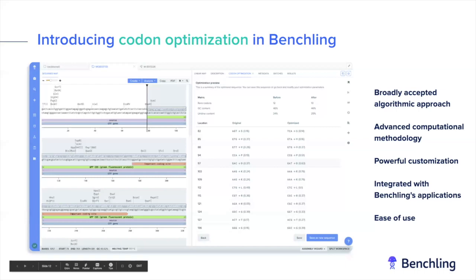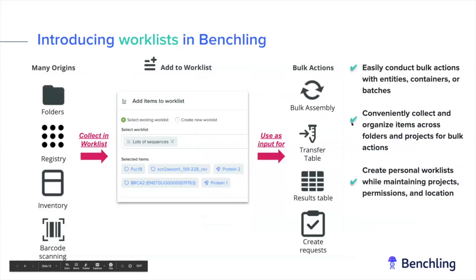The one other question here is, can it perform silent mutations? The codon optimization will be performing these silent mutations underneath the hood when adjusting for those codon frequency usages. And so, let's see, I'll just move forward now so that we can get through some of these slides.